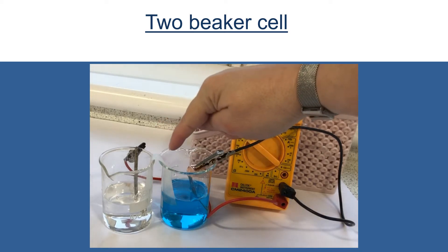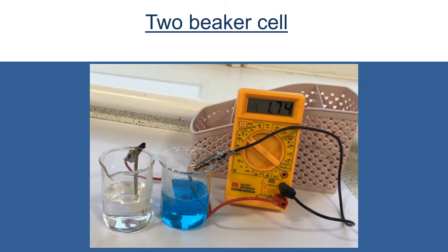Connecting both of these beakers we have our wet filter paper, so filter paper soaked in salt water. That's our ion bridge and it's required to complete the circuit.